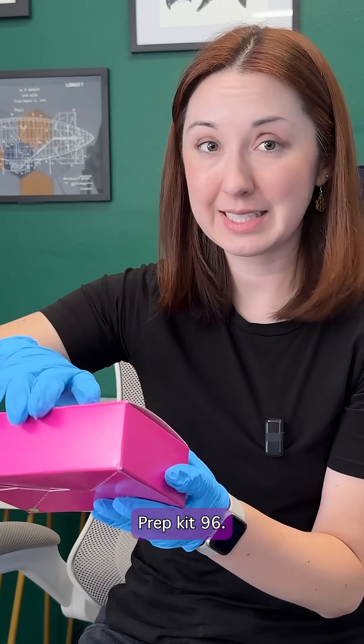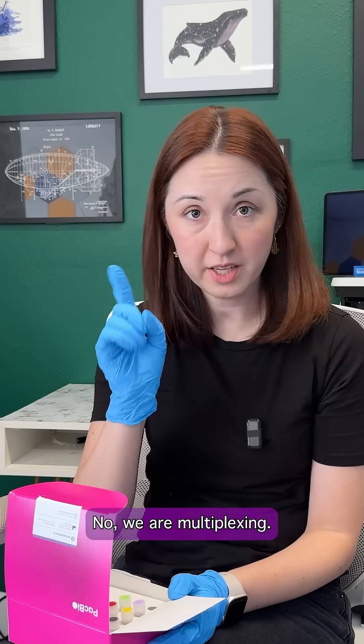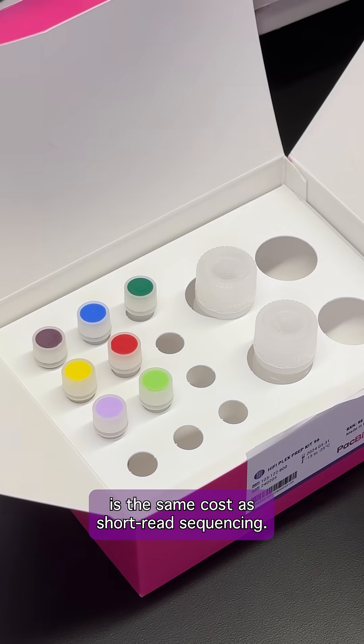And then we have the HiFi Plex Prep Kit 96. I have a bunch of samples that I want to multiplex and this is going to make that super easy. I'm not going to be sequencing one thing at a time — we are multiplexing. I'm really going to be getting more bang for my buck since HiFi microbial sequencing is the same cost as short read sequencing.